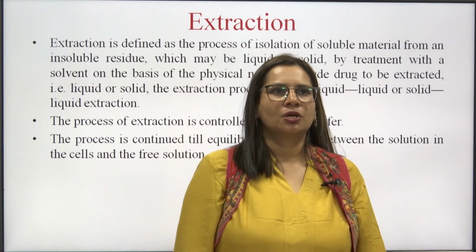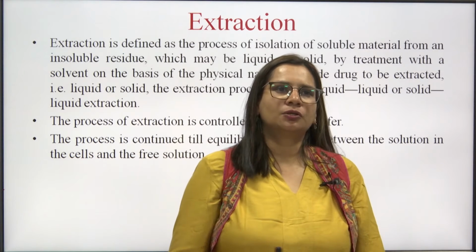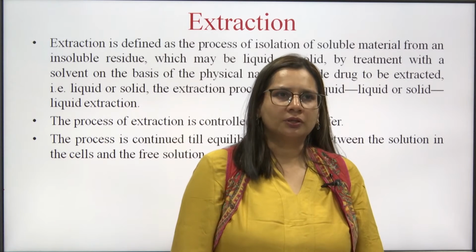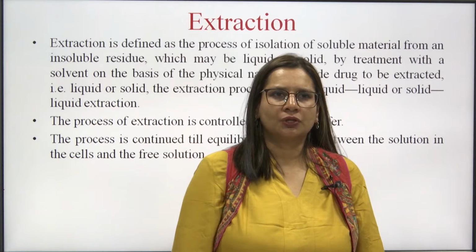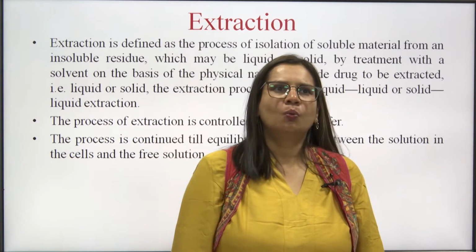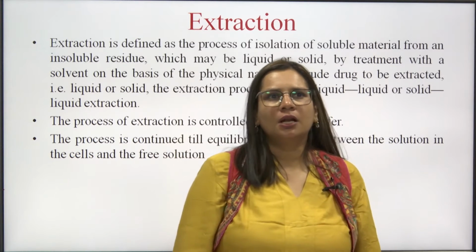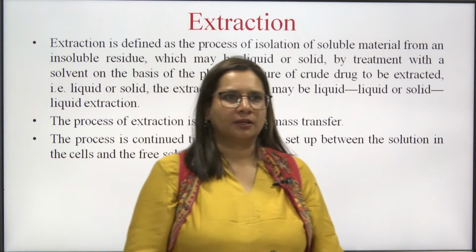Here we shall be discussing maceration, percolation, modified maceration and certain specialized extraction procedures. As the name suggests, extraction means dissolving the solute material using a solvent system and separating it completely. Extraction is defined as the process of isolation of soluble material from an insoluble residue, which may be liquid or solid, by treatment with a solvent on the basis of the physical nature of the crude drugs to be extracted.